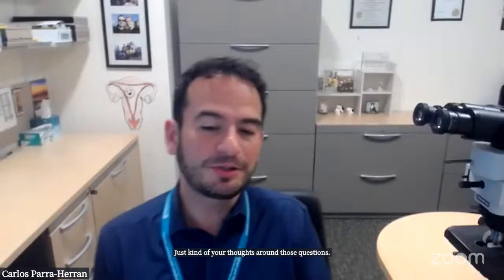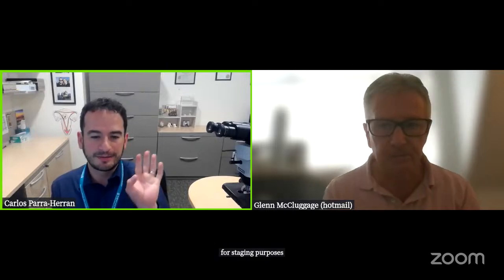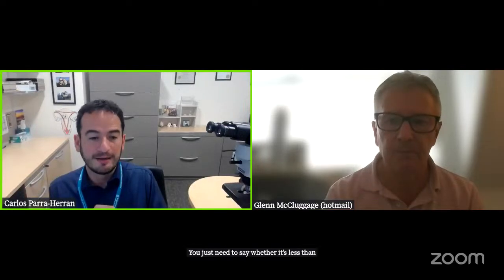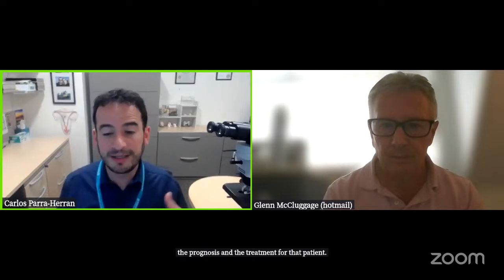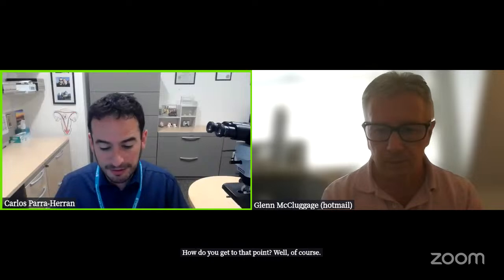Well, first of all, I think the recommendation for staging purposes is what you just described. You just need to say whether it's less than 50% or whether it's 50% or more, because that determines the stage and therefore the prognosis and the treatment for that patient. How do you get to that point? Well, in some cases, it's going to be very easy.